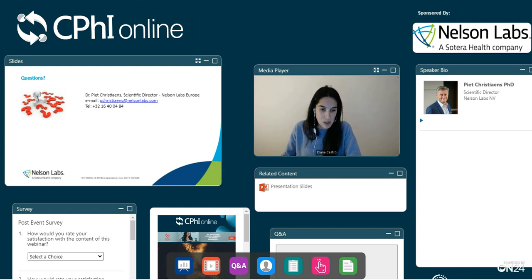But let's go with the first one. So there's a question saying, for extractables and leachables studies, do we need to perform it for the entire shelf-life storage, considering that it is a continuous process?